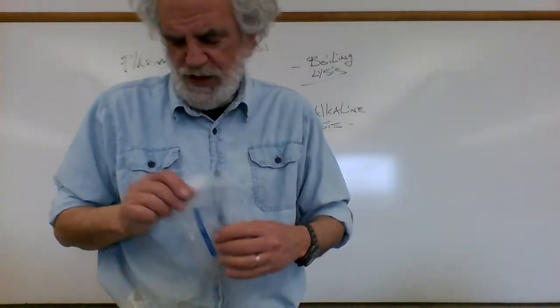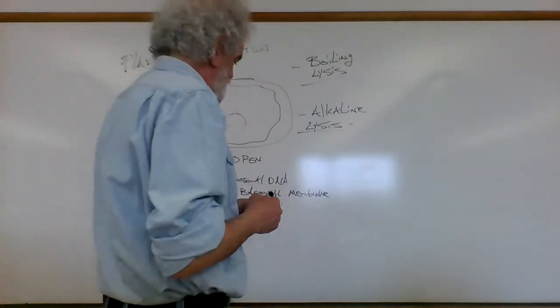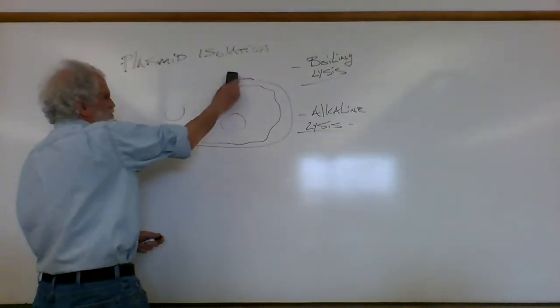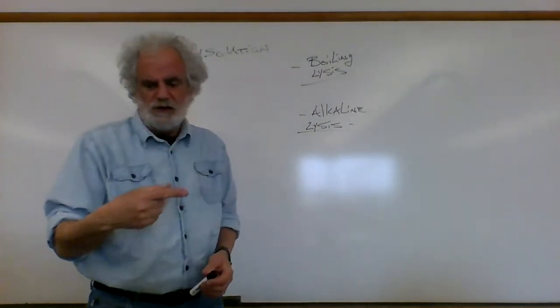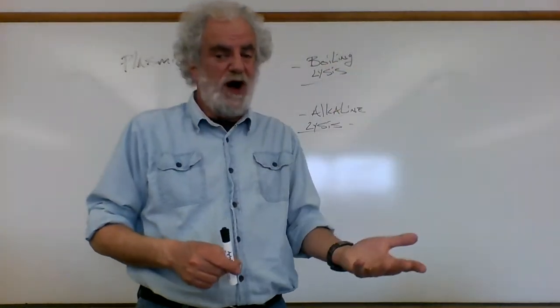So, the protocol, once we do the lysis, is to actually bind the DNA to the membrane. And we do this by centrifuging, spinning down the lysate in this little membrane cup. The DNA binds, and then we're going to do a series of washes.